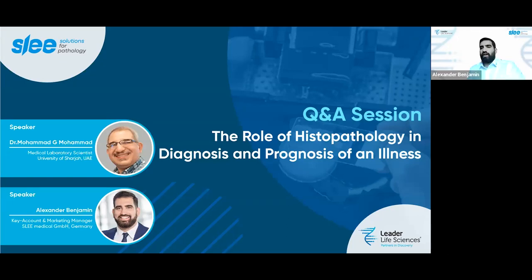Or maybe even manufacturers actually put effort in. But now this is why they provide tools in order to do coverslipping in the most proper way and to have the best, especially for labs doing digital pathology. Especially for digital pathology, the resolution and the coverslipping have to be done properly, yes.